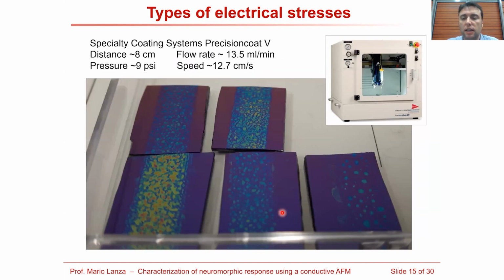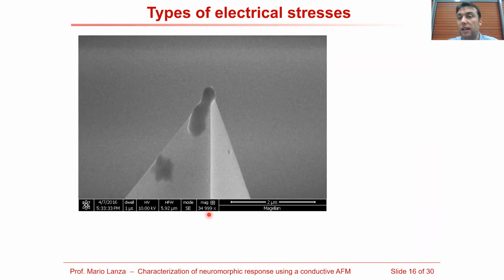So this is the system that we use to spray coat the material, the graphene oxide. It is a commercial system. We use some standard parameters in terms of distance between the tip and the sample, and also flow rate, speed, and pressure. And here you can see some pictures of the first samples that we used at the beginning. We see that when we increase the number of passes, we start to see a film that is a little bit more homogeneous. So these were the very first trials that we did, which required optimization.